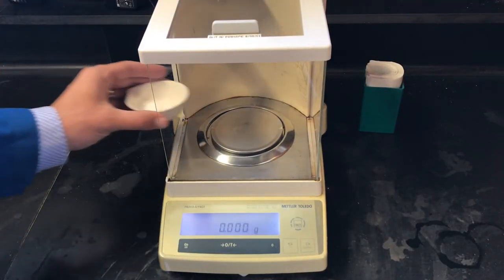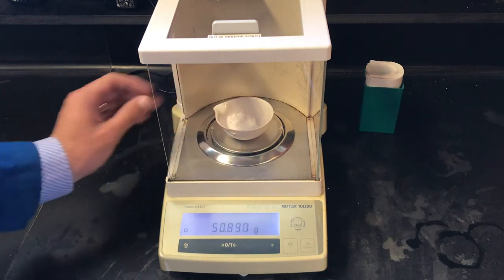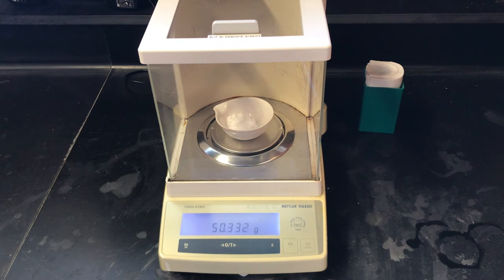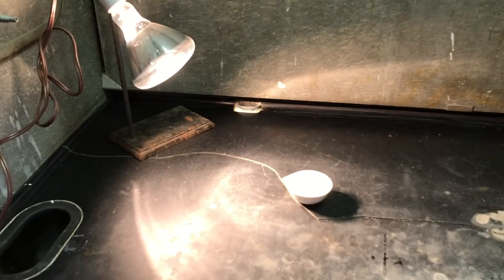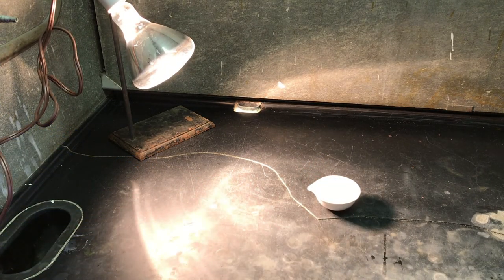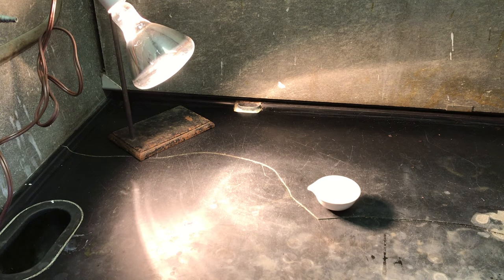We can now acquire the mass of our wet alum and our evaporating dish, which comes out to be 50.332 grams. We'll now place our sample of wet alum under a heat lamp, ensuring that it's not too close to the heat lamp, which might damage our product.